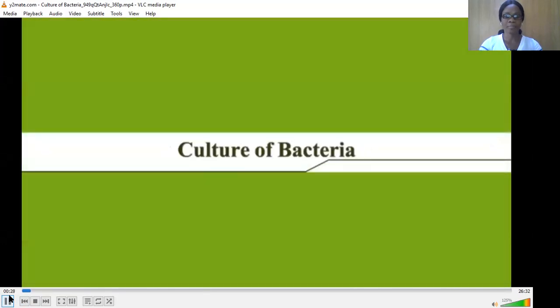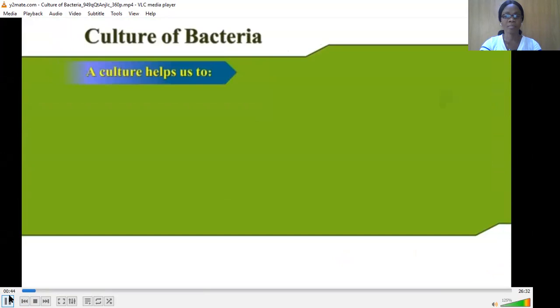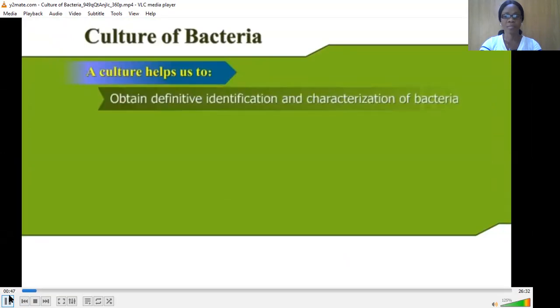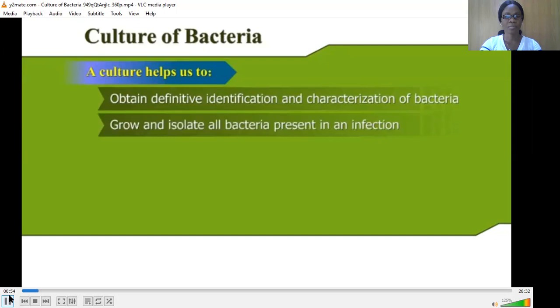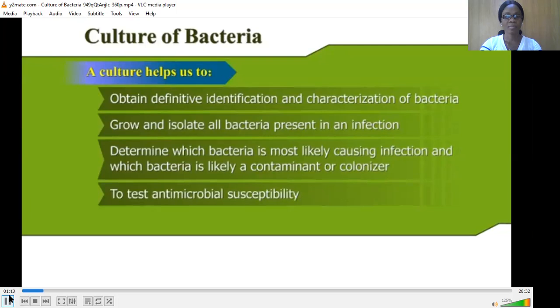Culture of bacteria. A microbiological culture is a method of multiplying microbial organisms by letting them reproduce in a predetermined culture media under controlled laboratory conditions. A culture helps us to obtain definitive identification and characterization of bacteria, grow and isolate all bacteria present in an infection, determine which bacteria is most likely causing infection and which bacteria is likely a contaminant or colonizer, to test antimicrobial susceptibility, to stock bacterial strains for further use.